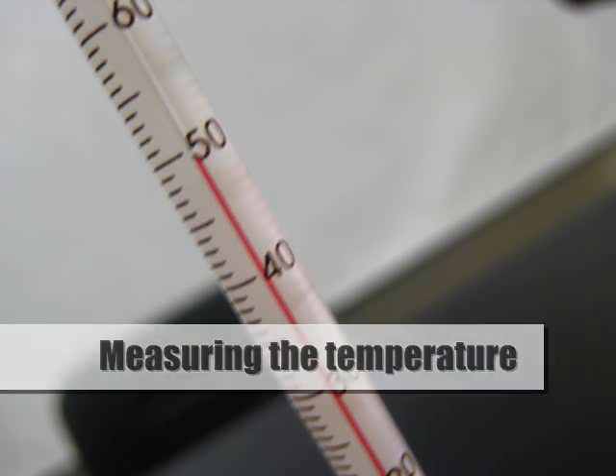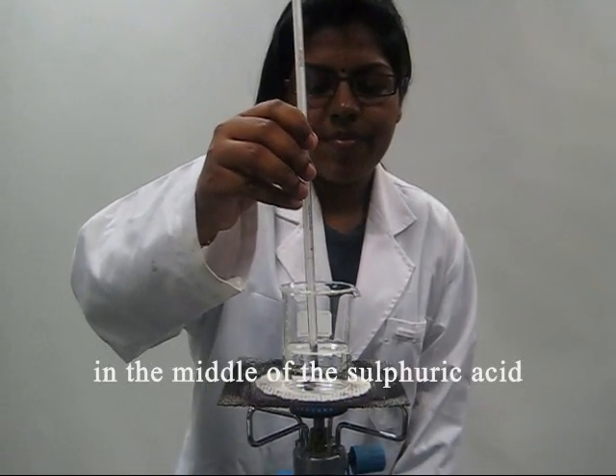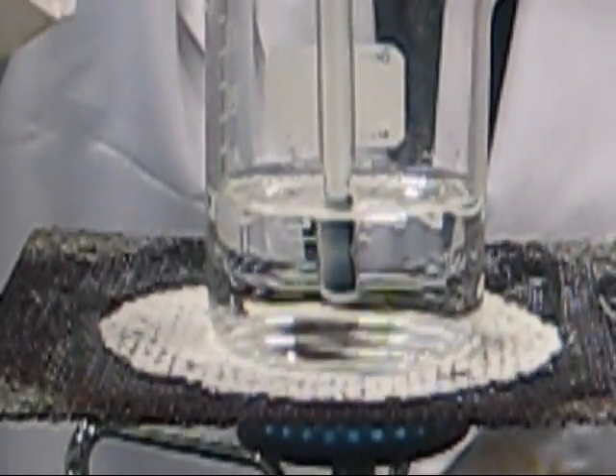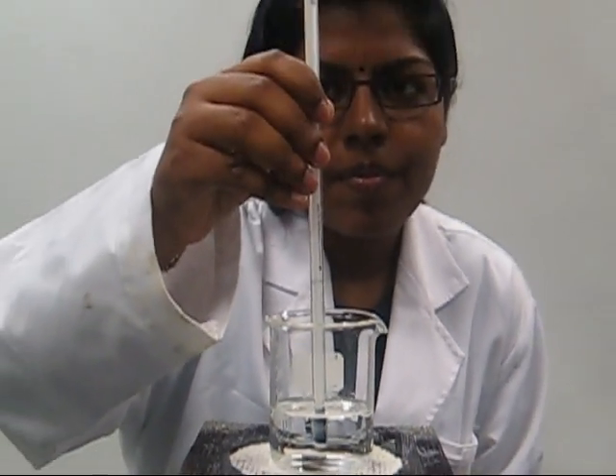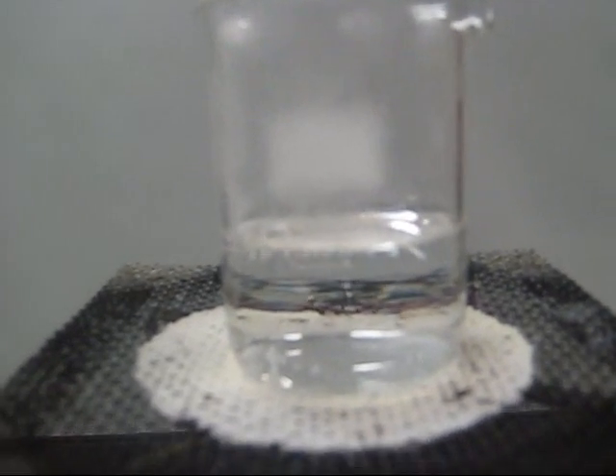Measuring the temperature: place the bulb of the thermometer in the middle of the sulfuric acid. Heat the acid to about 50 degrees Celsius. Do not let it boil.